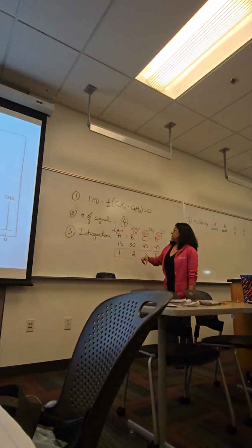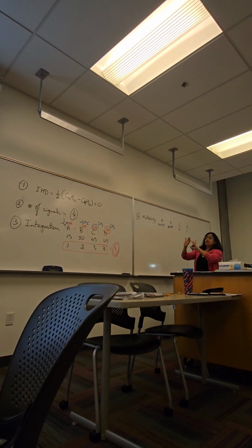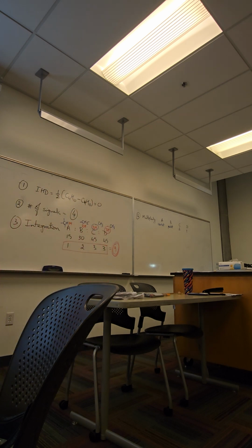We have a CH, we have CH2, we have CH3, we have CH3. How do we take those 4 pieces and connect them to each other so we can have a sextet, a pentet, a doublet, and a triplet? Suggestions. Here is where our creativity comes into play. This is the puzzle solving part of the whole process.